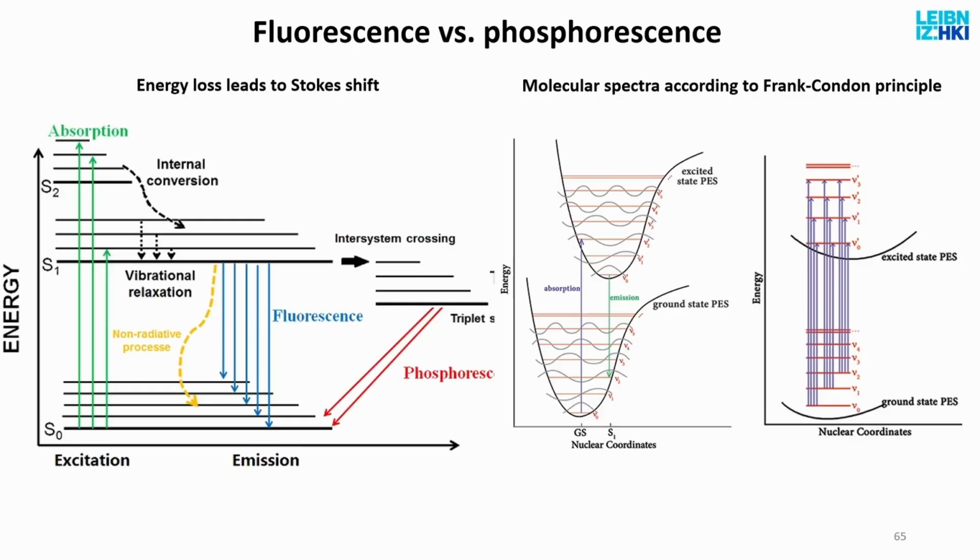So what happens when I illuminate a molecule with laser light? Well, as you know from quantum mechanics, molecules can absorb energy only in certain amounts. We have various energy levels. We have the base level where the electrons are at the lowest energy possible. This is where they like to be. But these electrons can also absorb energy if you, for example, illuminate them with a laser, which will make the electrons go to a higher energy level. But they don't like it, so they come back. How fast determines whether you are dealing with fluorescence or phosphorescence.